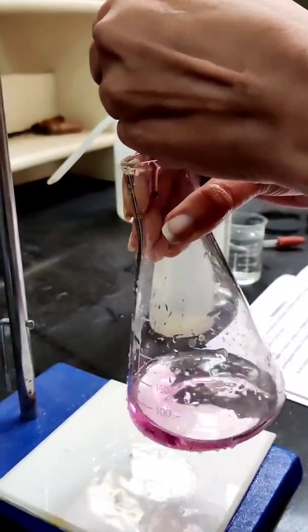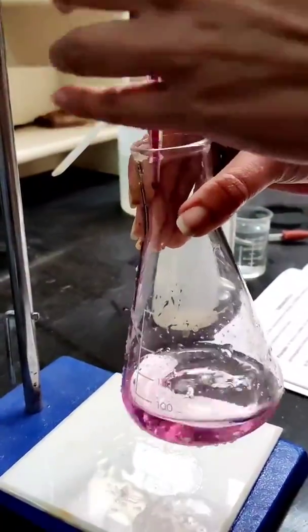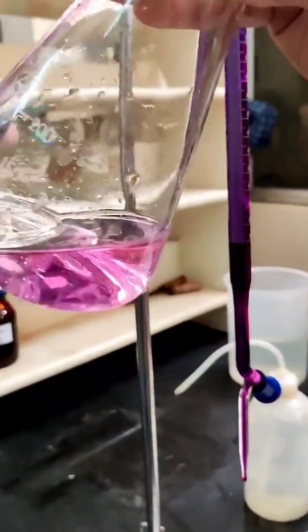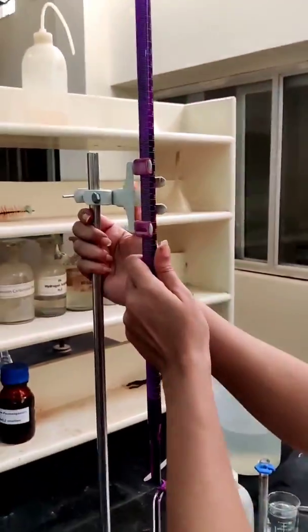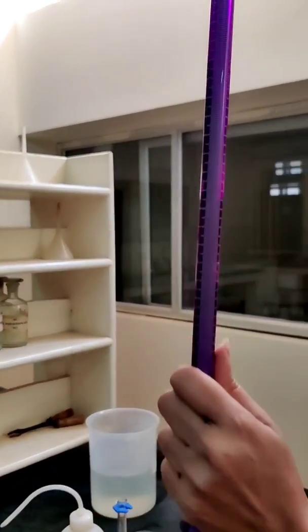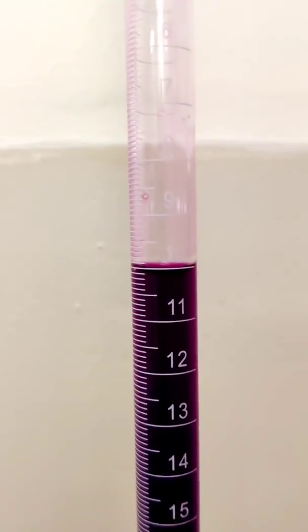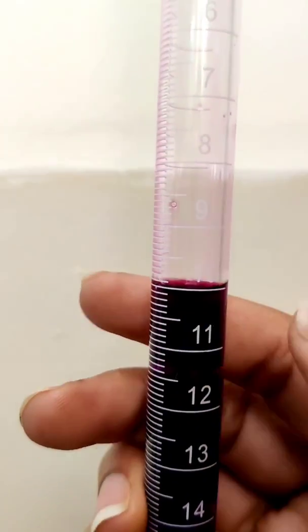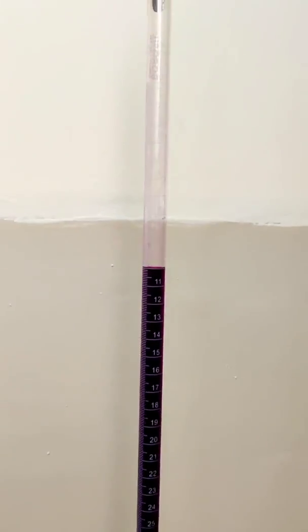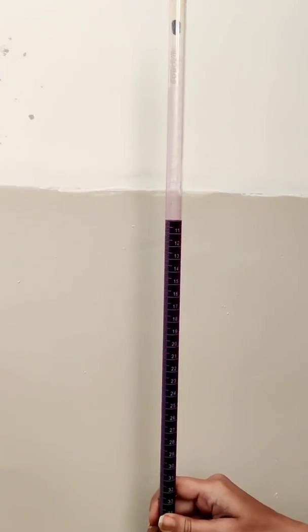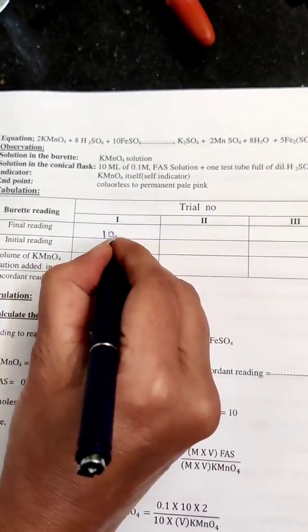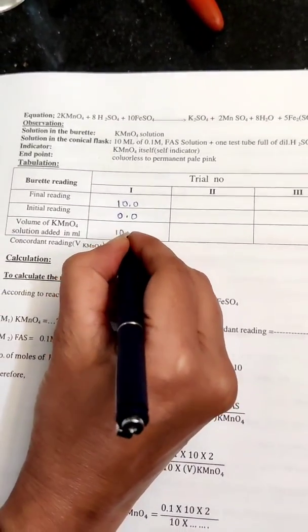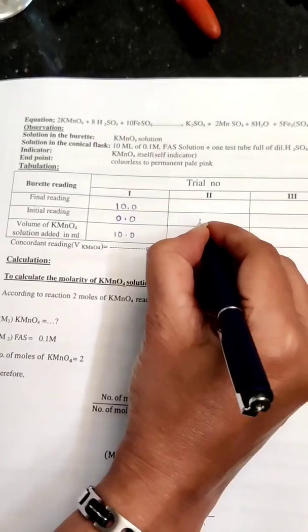Now, the solution has turned to pale pink color. You can see the pale pink color. Now, unclamp the burette and bring it to your eye level. Note down the final reading. You need to consider the upper meniscus. Note down the reading.